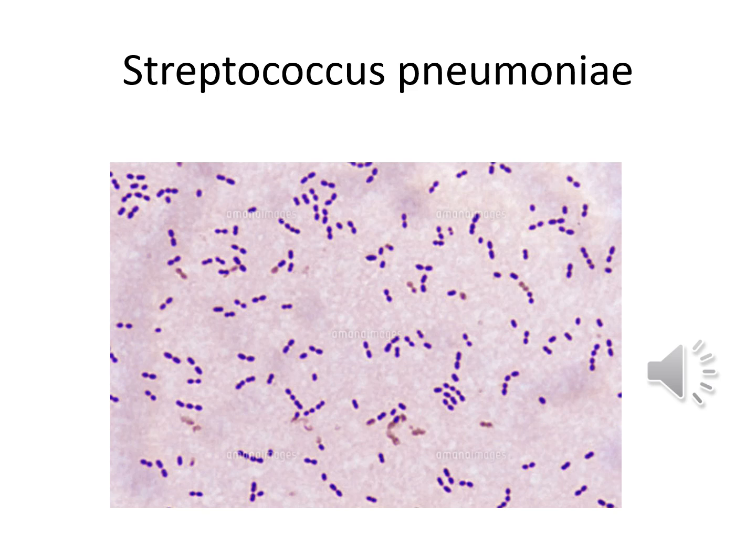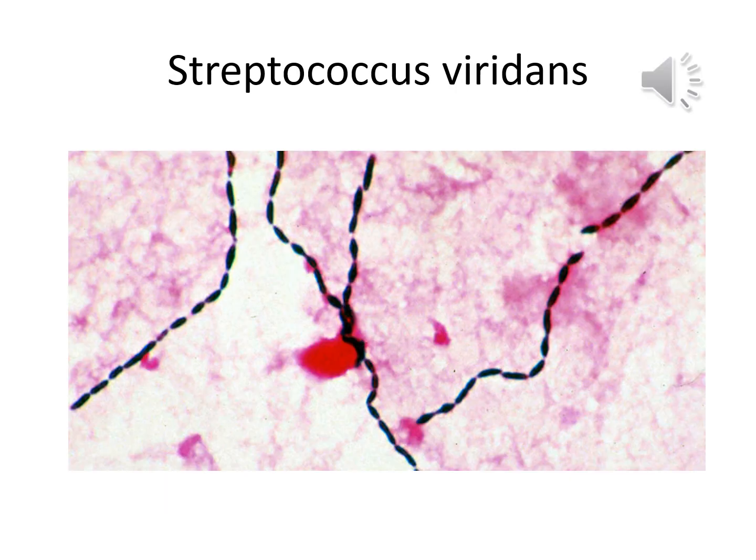This slide represents Streptococcus pneumoniae cells under light microscope. It is a gram-positive lancet-shaped coccus — elongated with a slightly pointed outer curvature — and usually seen as pairs (diplococcus), though it may also occur singly or in short chains. This slide represents Streptococcus viridans under light microscope, showing gram-positive cocci that usually form short to long chains and are often elongated.